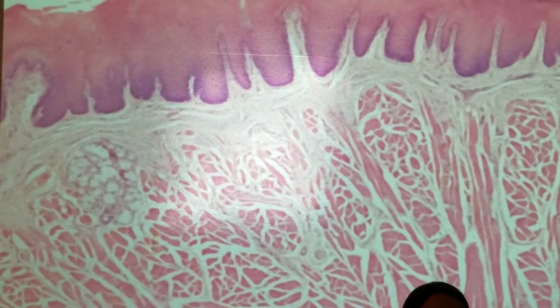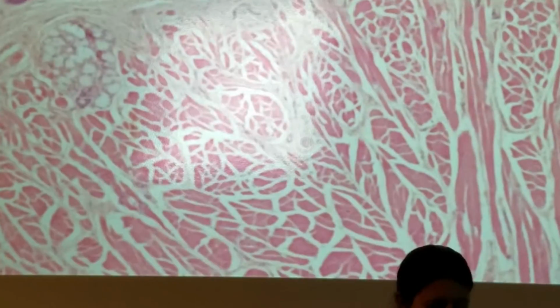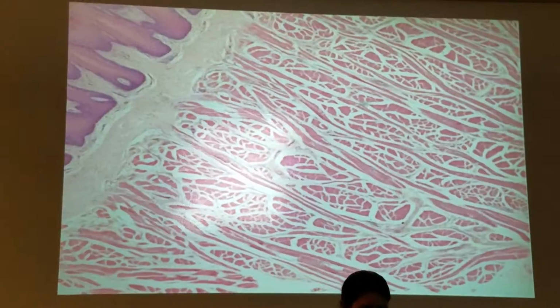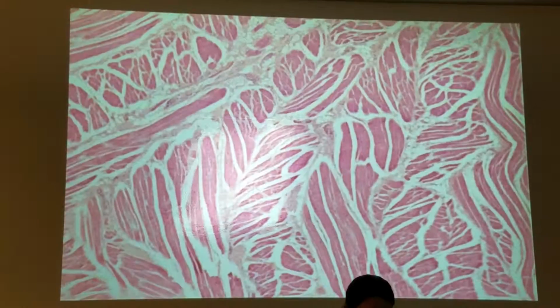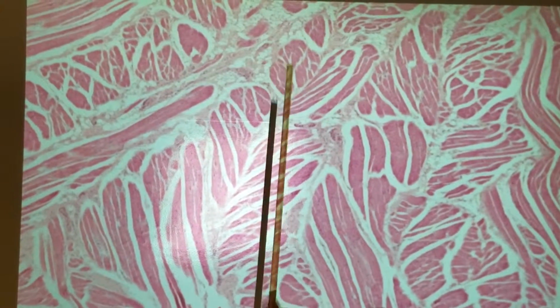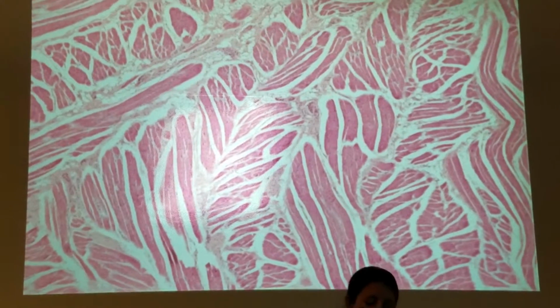That thing's a gland. Oh, no, sublingual gland. Where's some more? Oh, there it is. So we have this here. Adipose. Skeletal muscle. Tongue. The whole thing.